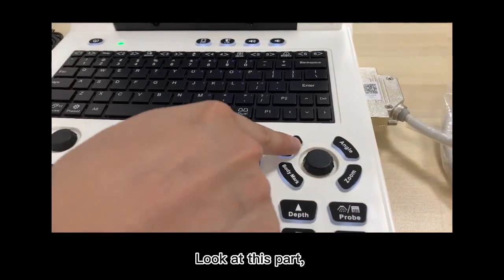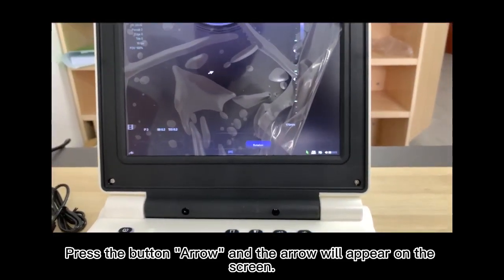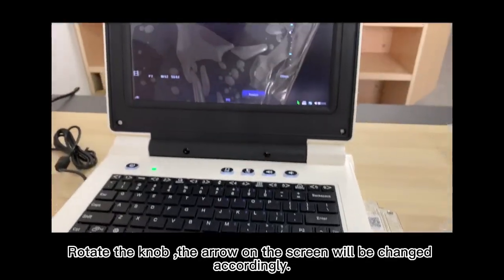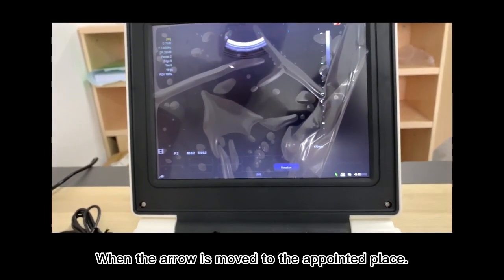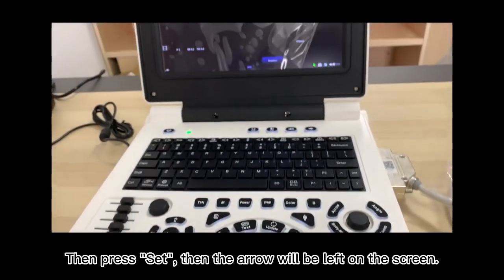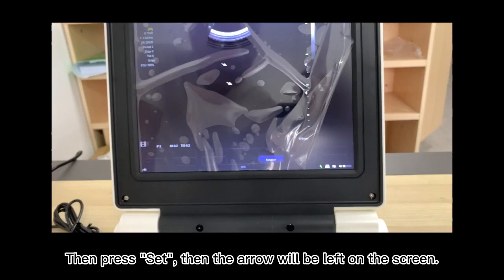Look at this part. Press the button arrow and the arrow will appear on the screen. Rotate the knob, and the arrow on the screen will change accordingly. When the arrow is moved to the appointed place, press Set, and the arrow will be left on the screen.